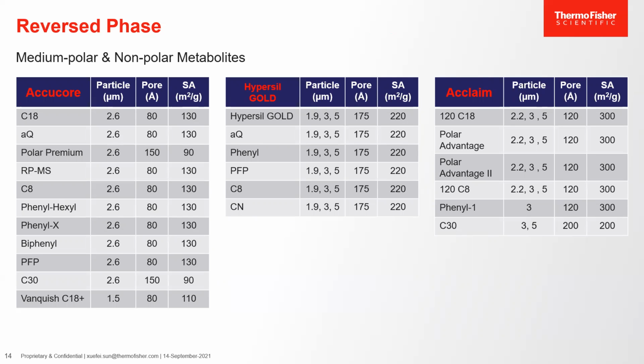The RPMS are going to be the columns that you're using on, let's say, clinical high throughput mass spec analysis, so something that's under 7 minutes with a very high flow rate where you're just trying to blow things through just to get the method done, because it can withstand that pressure background with good separation still.